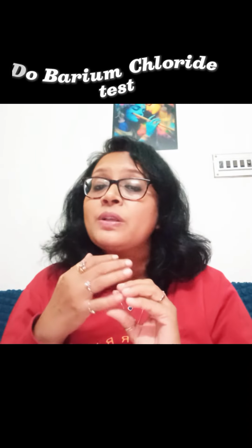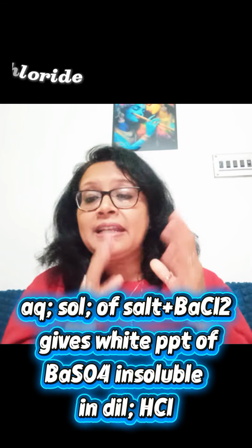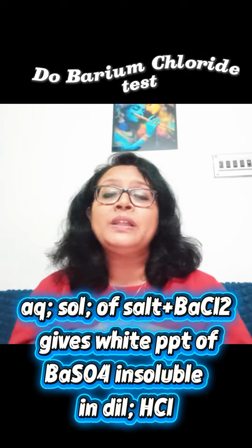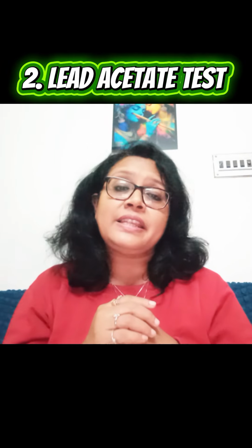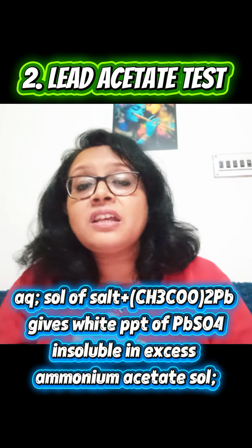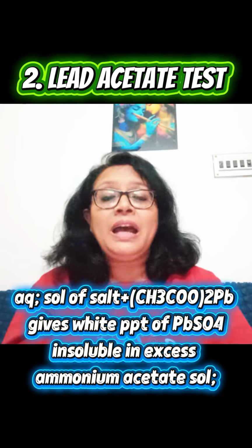So now I can say that if you have sulfate, do the barium chloride test where you are using aqueous solution of the salt and you are adding barium chloride solution, getting a white precipitate of barium sulfate which is insoluble in HCl. Now, number two test is a lead acetate test where you get again white PPT of lead sulfate which is insoluble in excess of ammonium acetate solution. So these are the two confirmatory tests for sulfate ion.